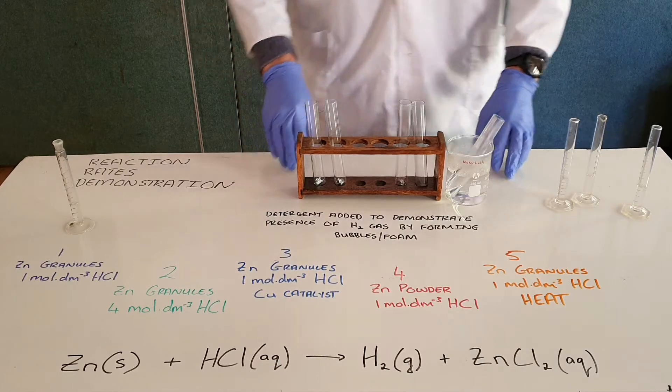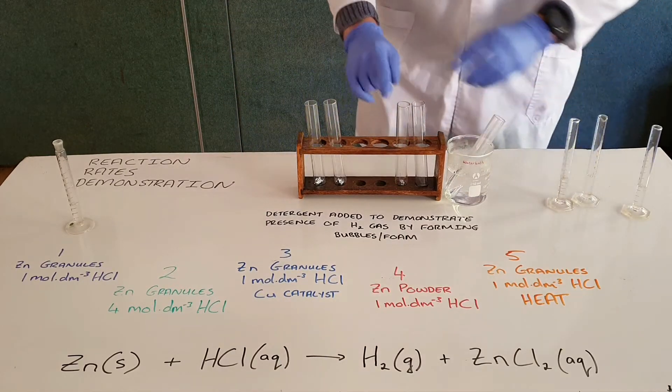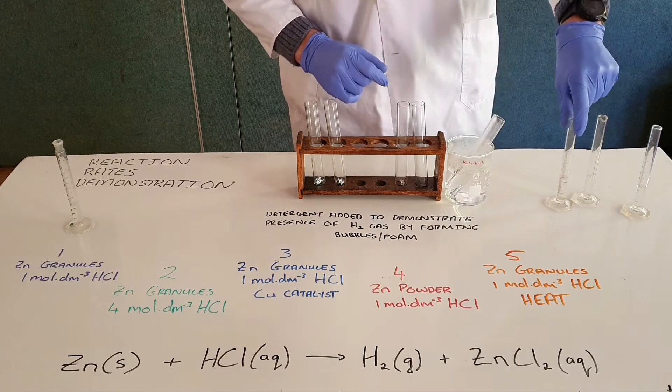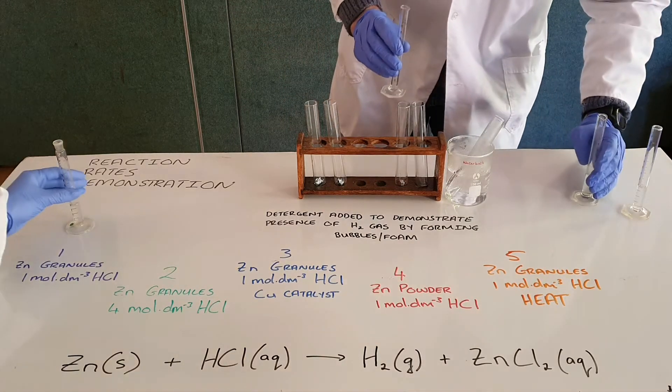So what we're going to do now is add the hydrochloric acid to each of these test tubes and observe the rate of each of these reactions and how they proceed.